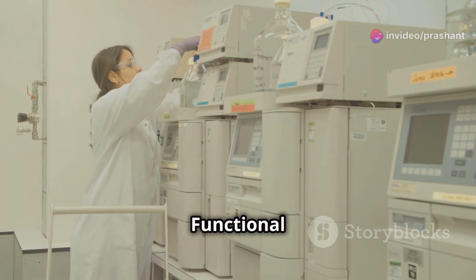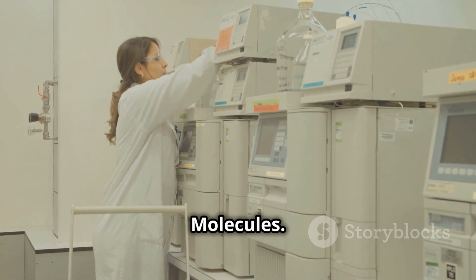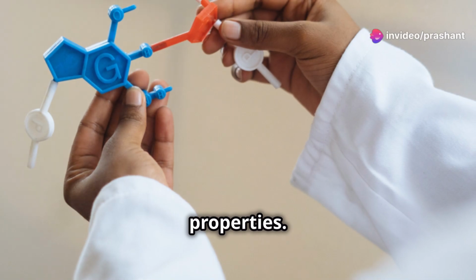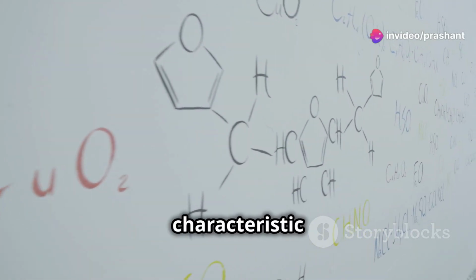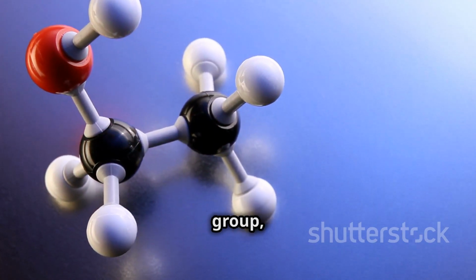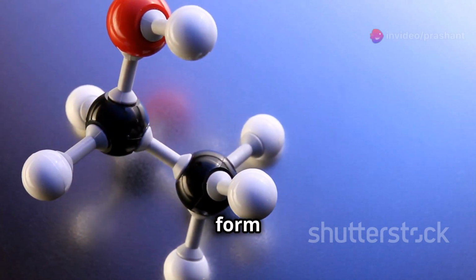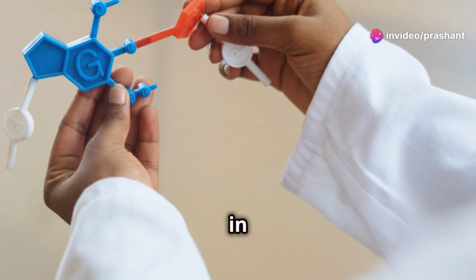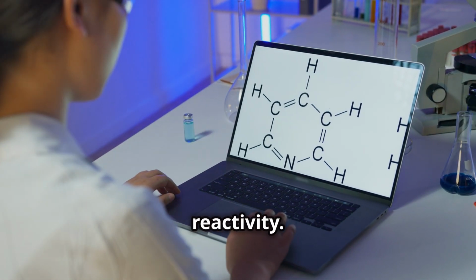Section 8. Functional groups in IR. Identifying the building blocks of molecules. Functional groups are like building blocks that give molecules their unique properties. They are specific groups of atoms within a molecule that are responsible for its characteristic chemical reactions and physical properties. For example, the hydroxyl group, or OH, is found in alcohols and makes them polar and able to form hydrogen bonds. The carbonyl group, or C=O, found in aldehydes and ketones, is responsible for their distinct odors and reactivity.